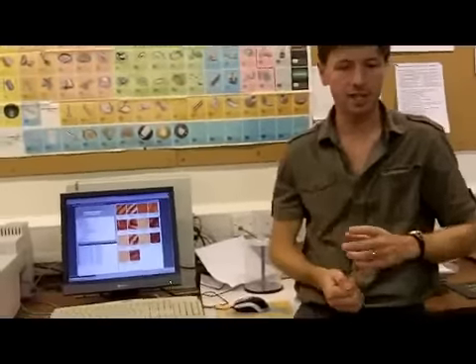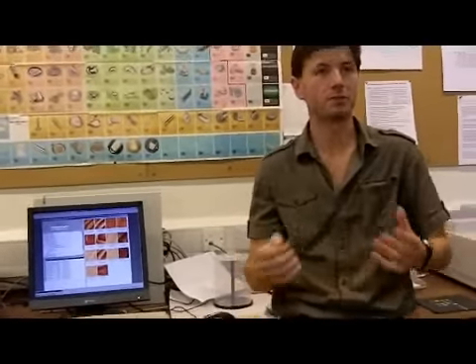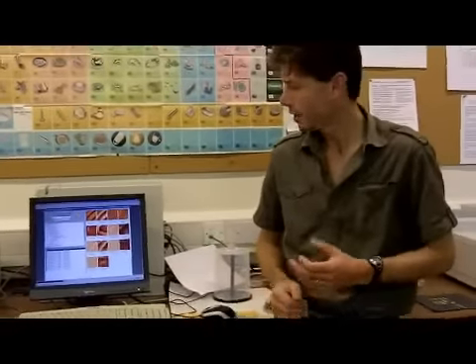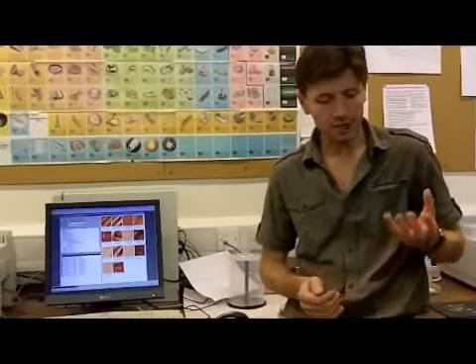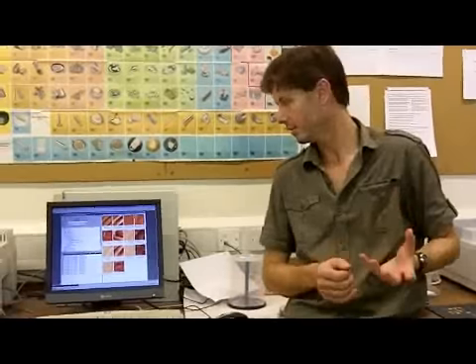Now, these two types of images have different purposes. With our spectrometer, it records both simultaneously. So somehow it keeps the constant current and a constant height. We won't worry about how. But they have different purposes. The constant height gives you usually a better image, better resolution.